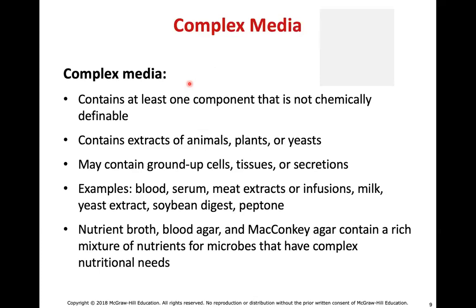Complex media, on the other hand, is one in which at least one of the components is not chemically defined. Now, we typically see most media being complex media, especially if this is just plain old culture media to grow up a microorganism. And what we mean by not defined is the recipe for, say, a complex media might call for 10 grams of protein in a liter of water. You're putting in 10 grams of protein, but you're not really defining what that protein is composed of.